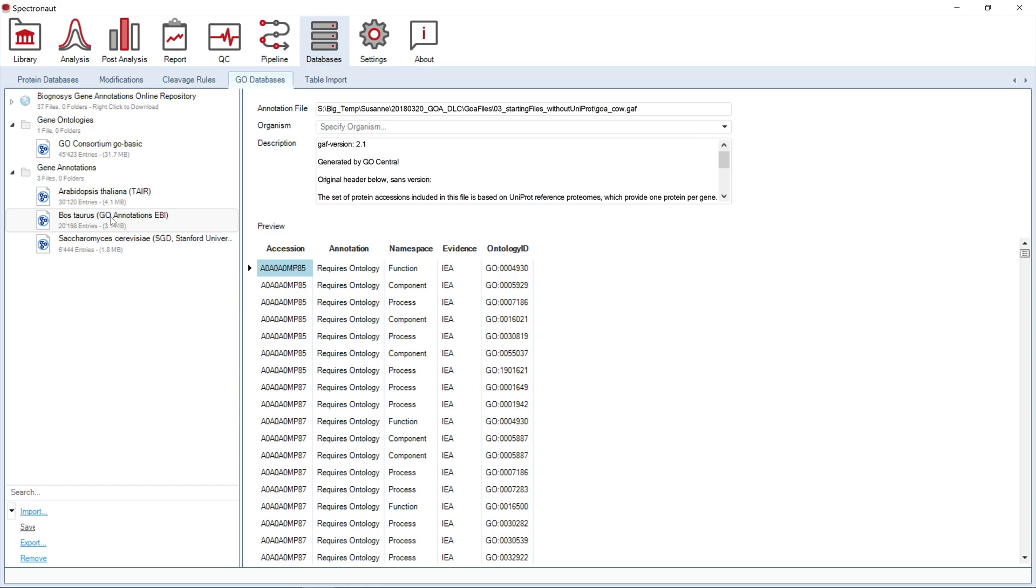Finally, the table import tab will be helpful if you would like to import spectral libraries generated using other resources. Spectronaut can remember column names in user spectral libraries.